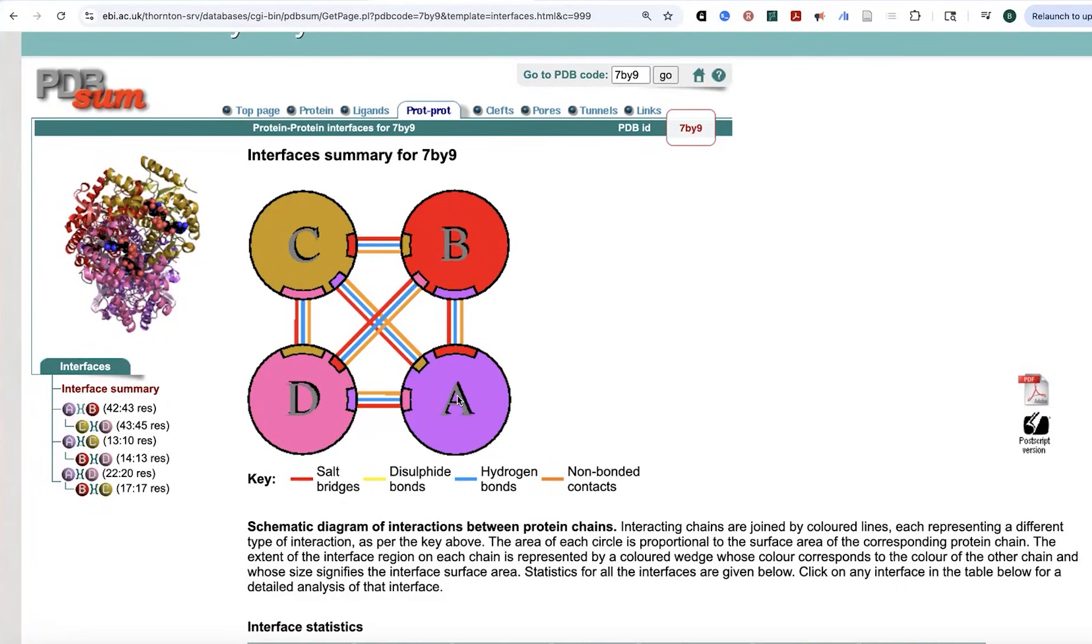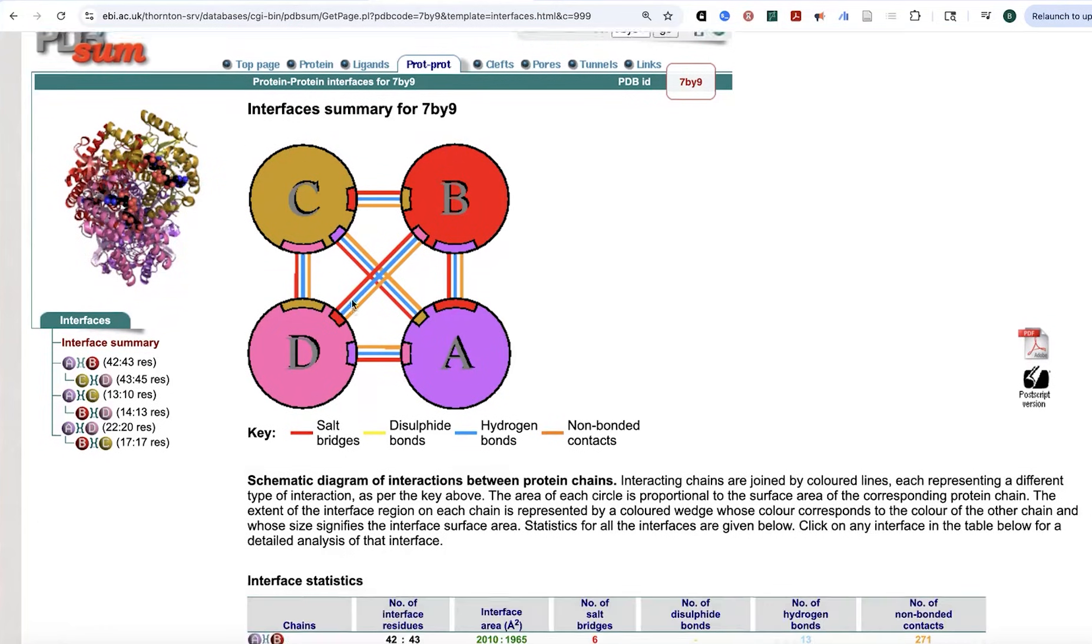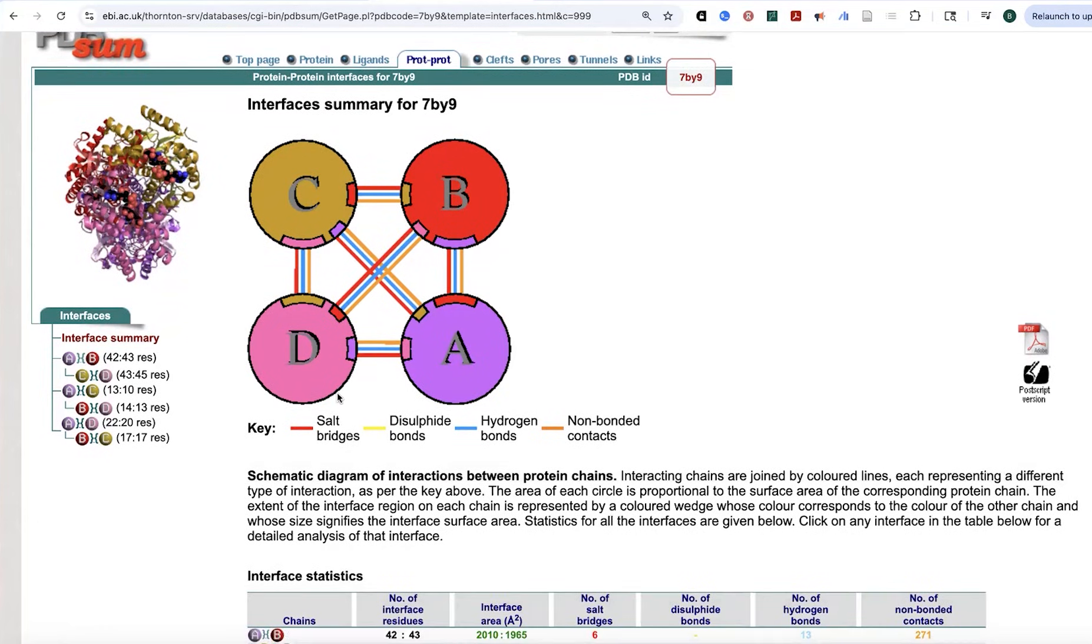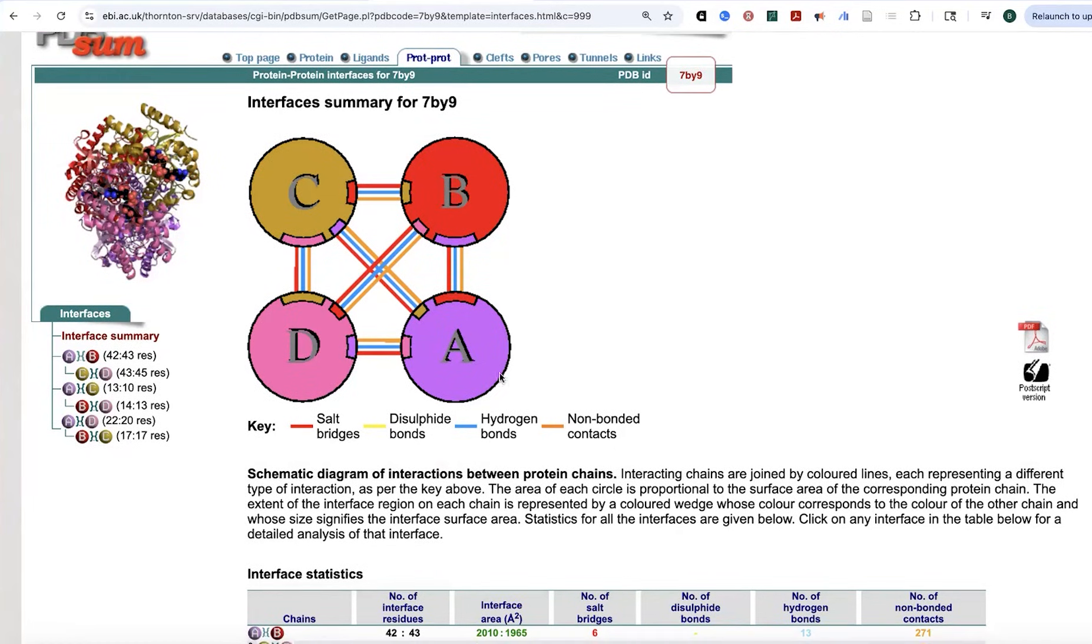So we can have A to B, A to C, A to D, D to B, D to C, D to A, you get the point. And we can have different types of interactions. So we can have salt bridges, disulfide bonds, hydrogen bonds, or non-bonded contacts. And so they're very good about giving you a key so you can tell what's what and color coding things.